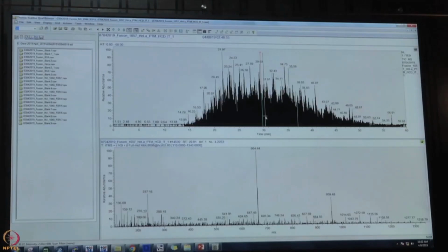So, till now we have seen the different liquid chromatography parameters and the mass spectrometry parameters required for the success of an LC-MS experiment. As you now know, the charged species enter into the mass spectrometer and get fragmented. These fragments are then detected, and by use of suitable software, the identification of the peptide is revealed. However, just by looking at the chromatogram, one can easily deduce whether the sample run was good enough to be taken to further analysis.